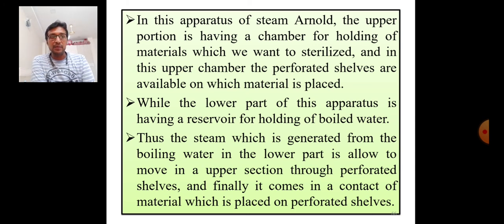In this apparatus of the steam Arnold, the upper portion is having the chamber.